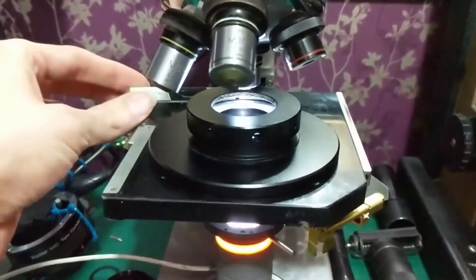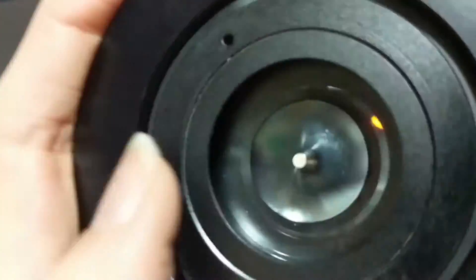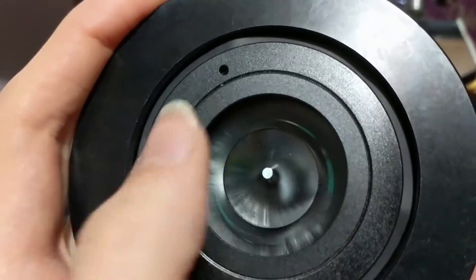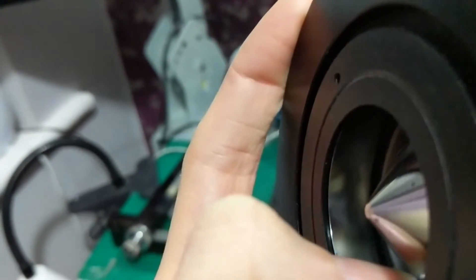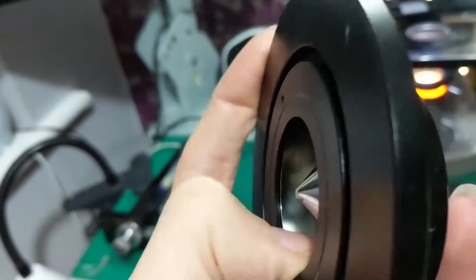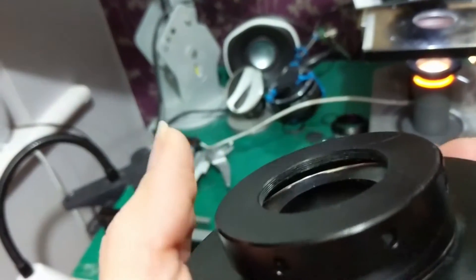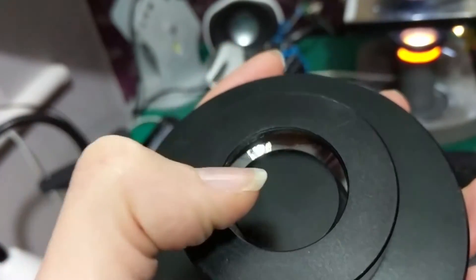I'll show you a little bit more about how this works. You can see the cone on the inside, which is made out of plastic and is suspended by a disk of clear plastic in the center of the light path. Inside here you've got a metallized finish — I'm not sure if it's actually metal as I haven't taken it apart — and it reflects off of that metallized inside, which acts as a kind of light guide, then reflects to the focus point directly above where the stage is.